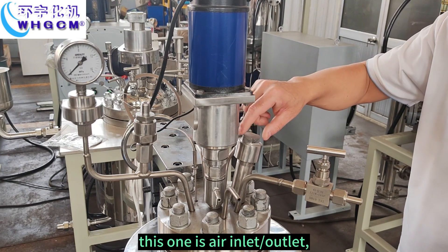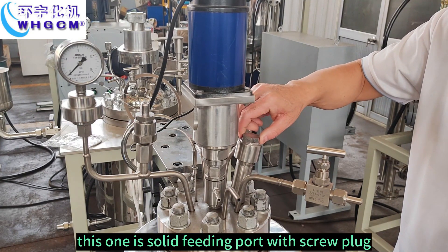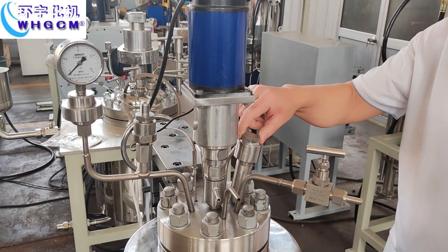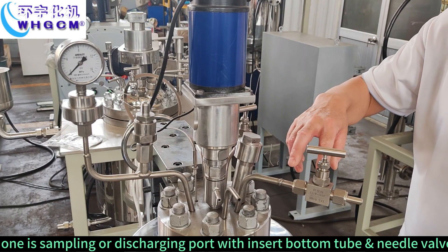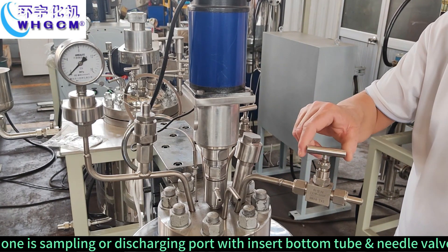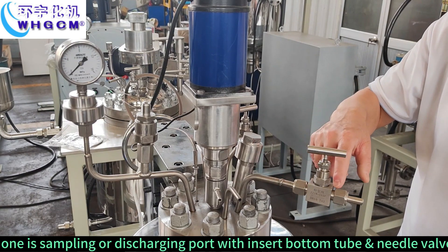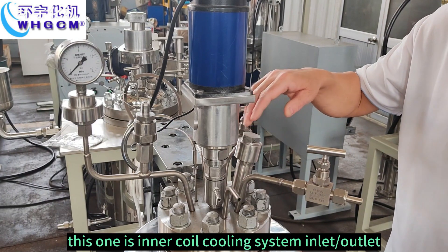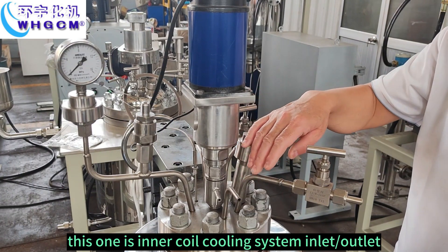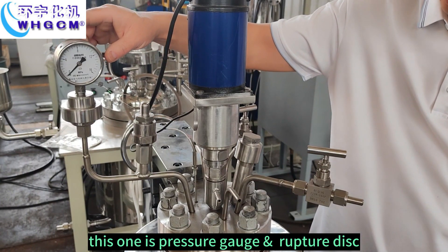This one is for air inlet outlet. And this one is a solid feeding port with a screw plug. This one is a sampling or discharging port with inset bottom tube and needle valve. This one is an inner coil system inlet outlet. This one is pressure gauge and rupture disc.